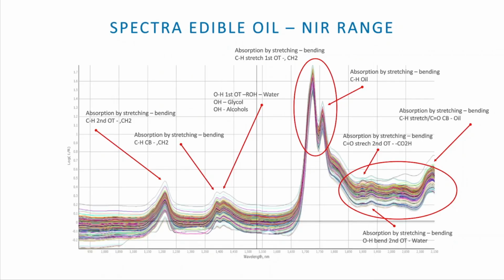This is the spectral database in the near-infrared region. The information on the carbon, hydrogen, oxygen molecular bonds is distributed over the whole range, but especially between 1700 nanometers and 2200 nanometers. The chemometric study in agri-food products, differently from pharmaceuticals and chemicals, must necessarily consider the heterogeneous nature of absorption overtones. Each constituent requires a full range development model.